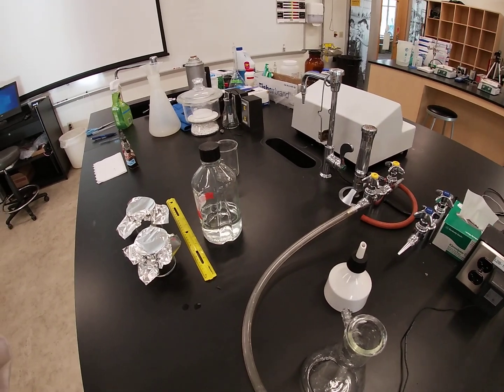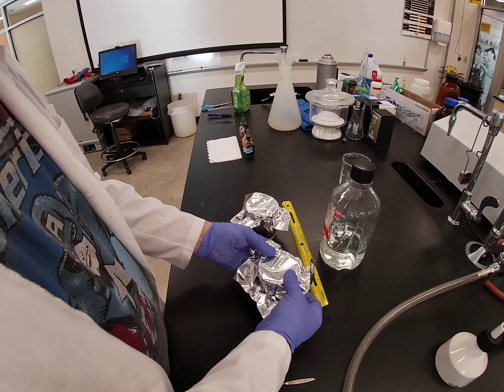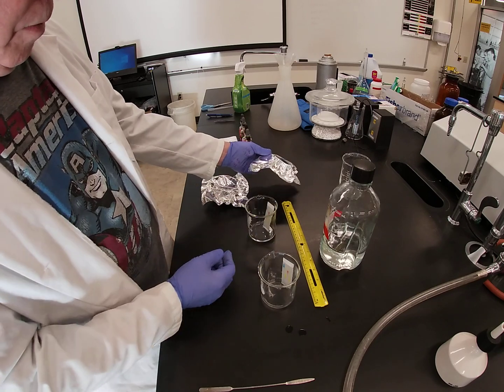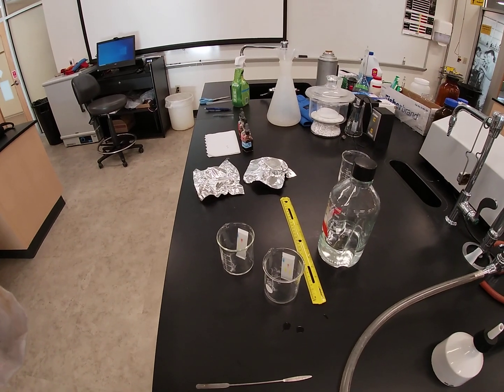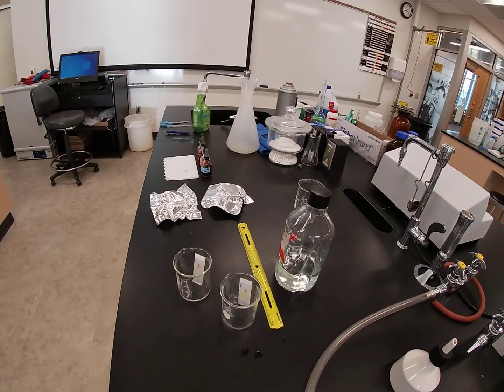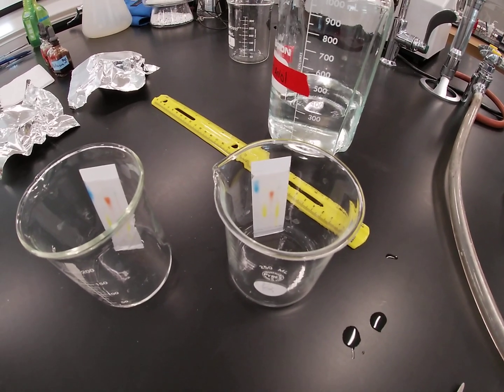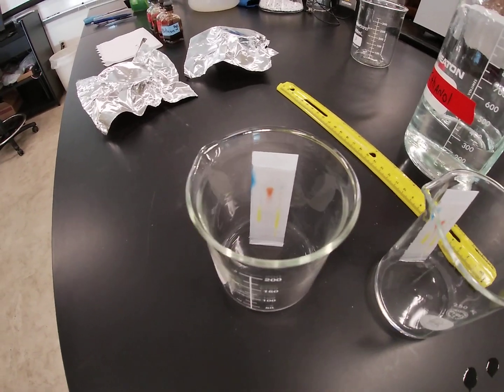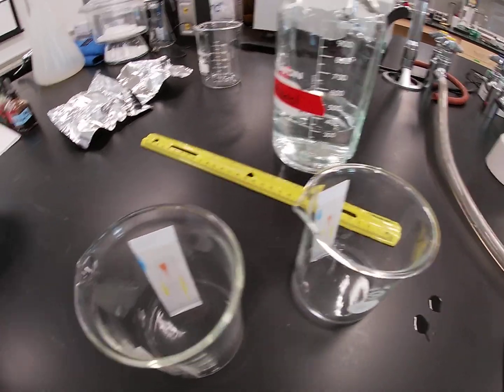So while we are here, we're going to take a look at our TLC plates, and we'll see that in both cases, hopefully you can see those. Probably can if I get a little closer. You should be able to note that our mobile phase has reached the end as far as it's going to go anyhow.